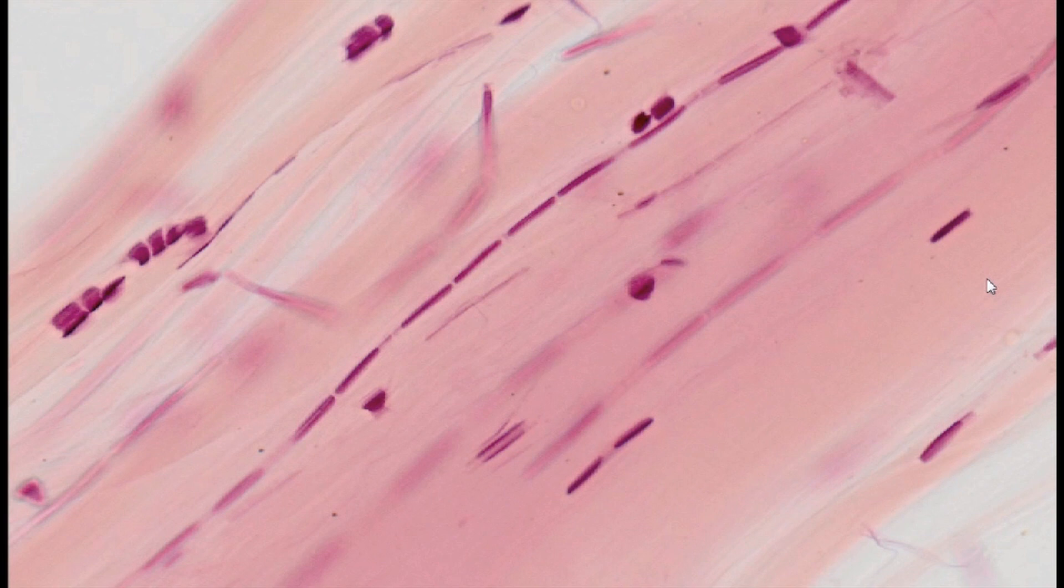Between the bundles are hematoxylin-stained nuclei of fibrocytes, the dormant form of fibroblasts. These cells differ from their precursors by reduced cytoplasm, loss of basophilic character, and a small nucleus indicating limited DNA transcription.